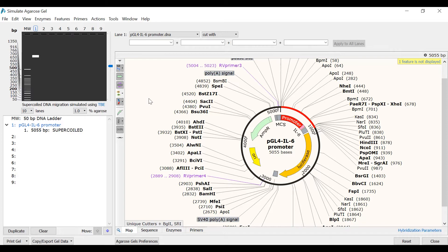By default, the agarose gel shows 10 lanes. By using the dropdown menu, you can change the number of lanes to 12, 16, 20, or 26. I will leave this as 10 lanes for now.